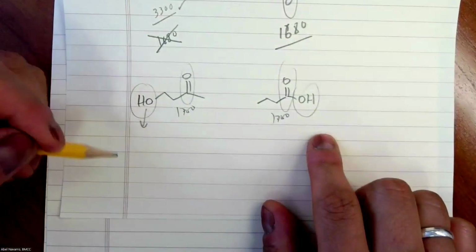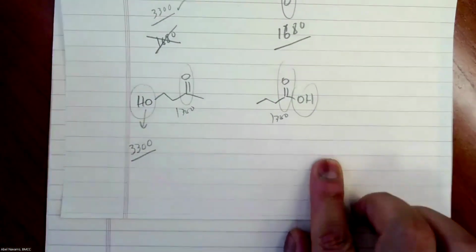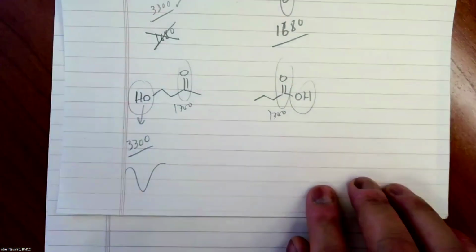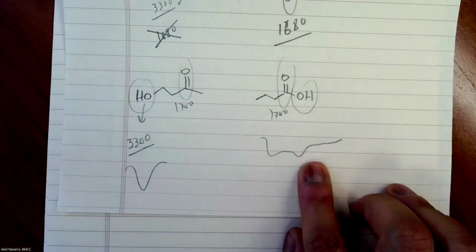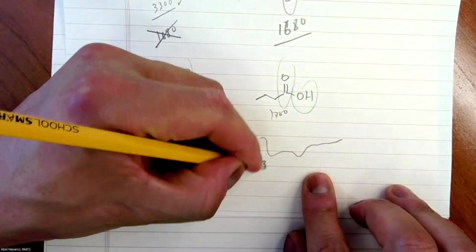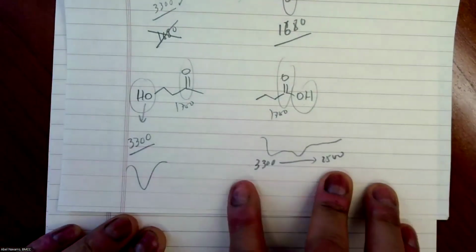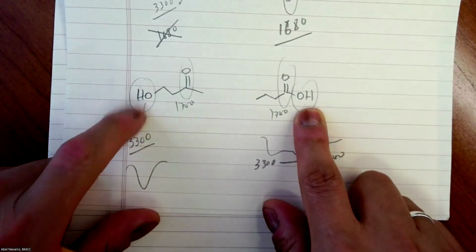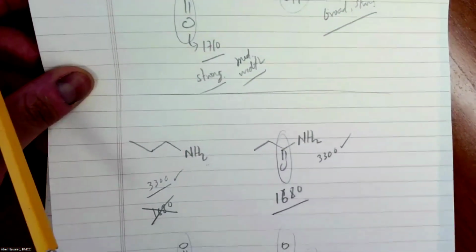This OH will be a strong peak around 3300, well defined. Whereas the OH here is going to be what? It's going to be distorted, more or less above 3300 all the way to 2500, right? Why? Because this is a carboxylic acid, and this one is an alcohol with a ketone completely separated. Okay, so those are questions that you guys might get from this.